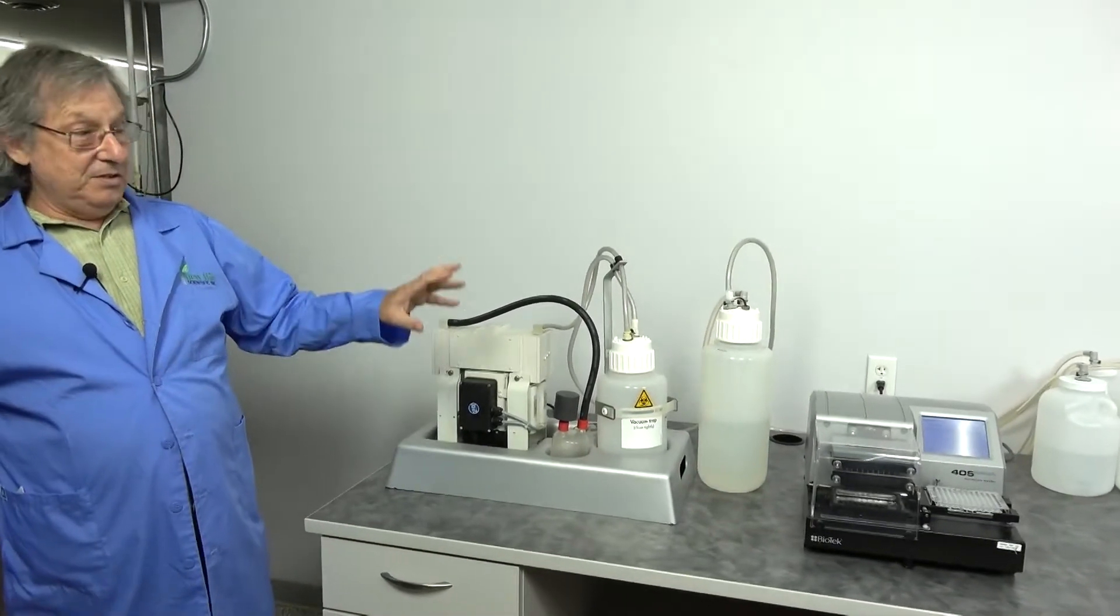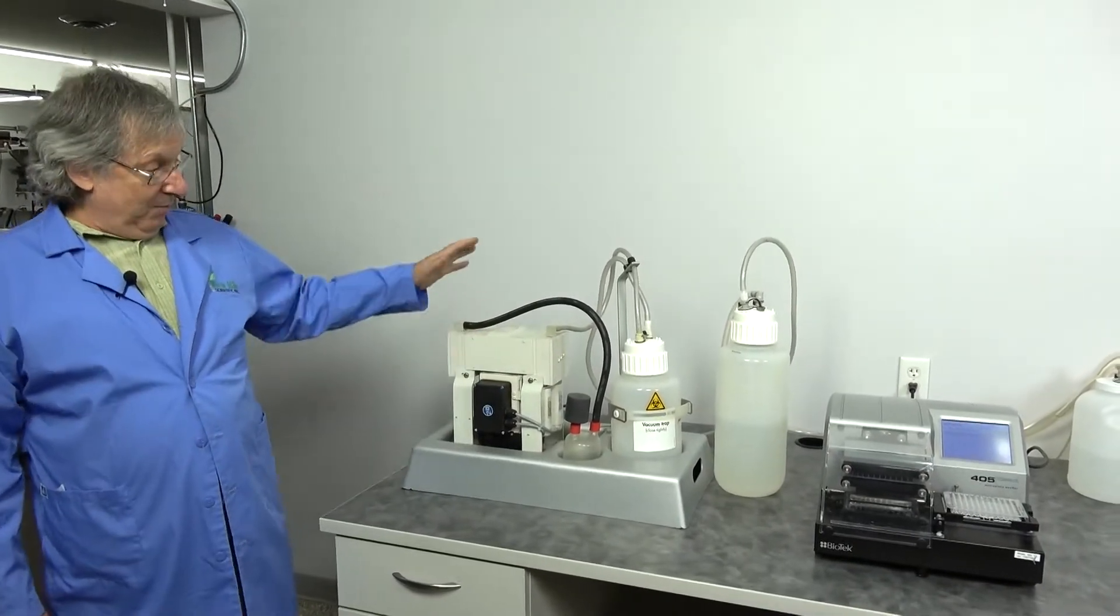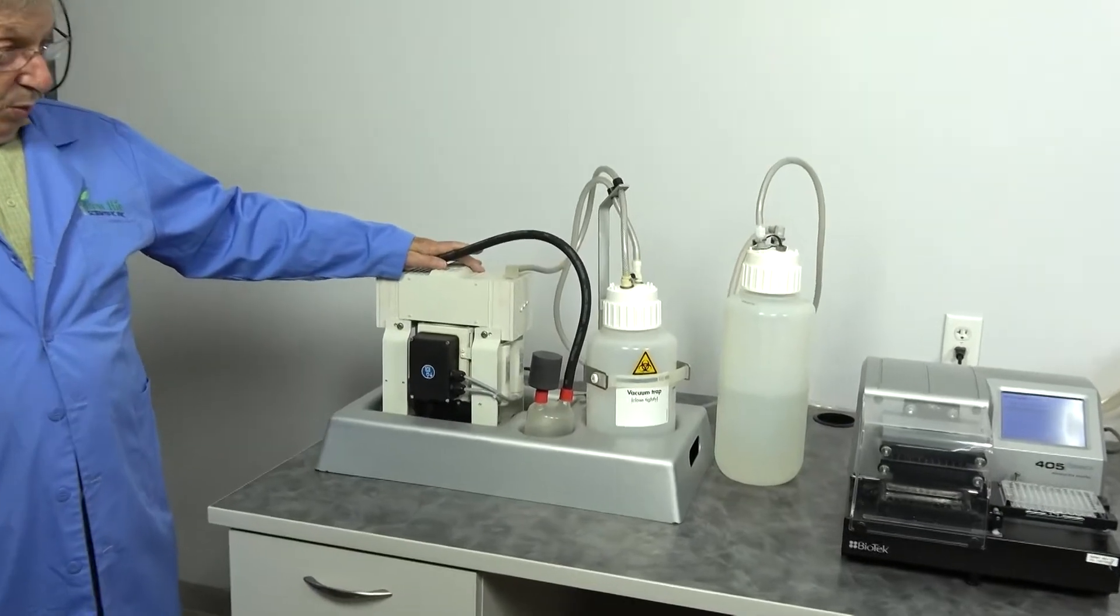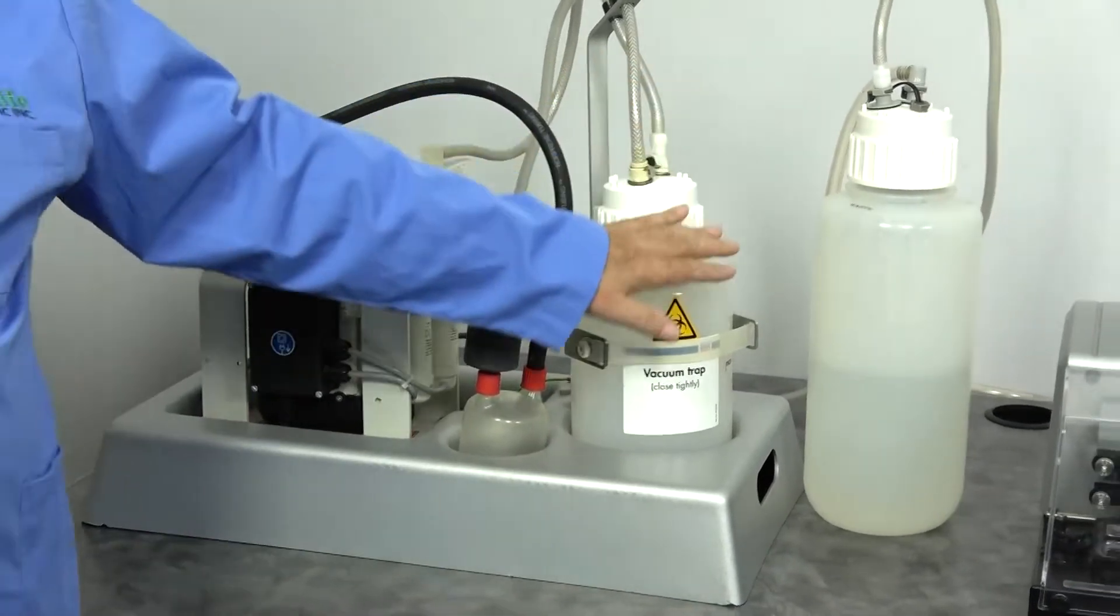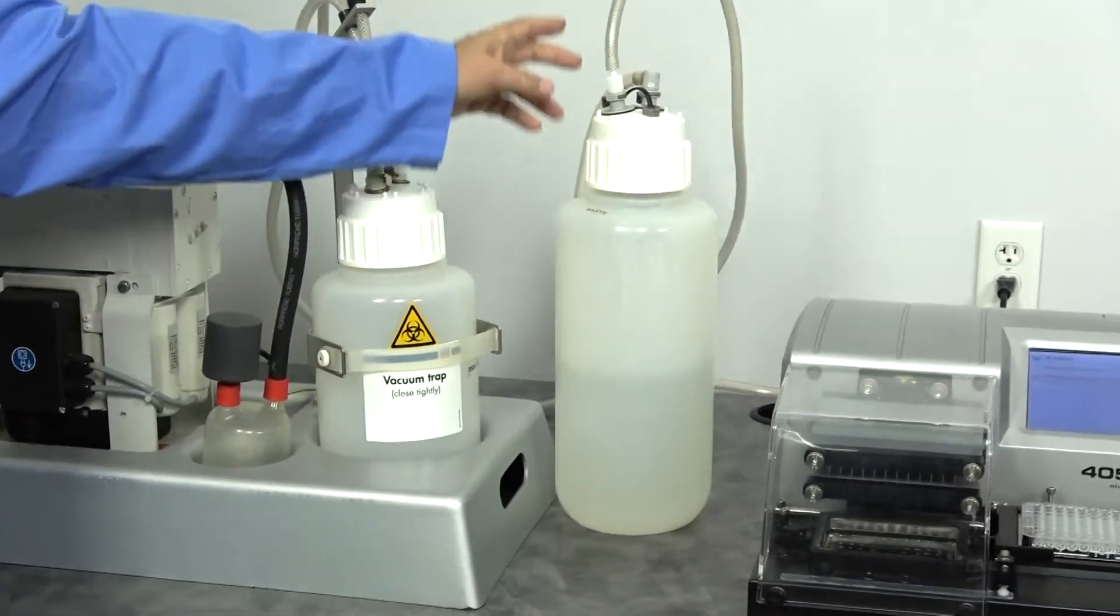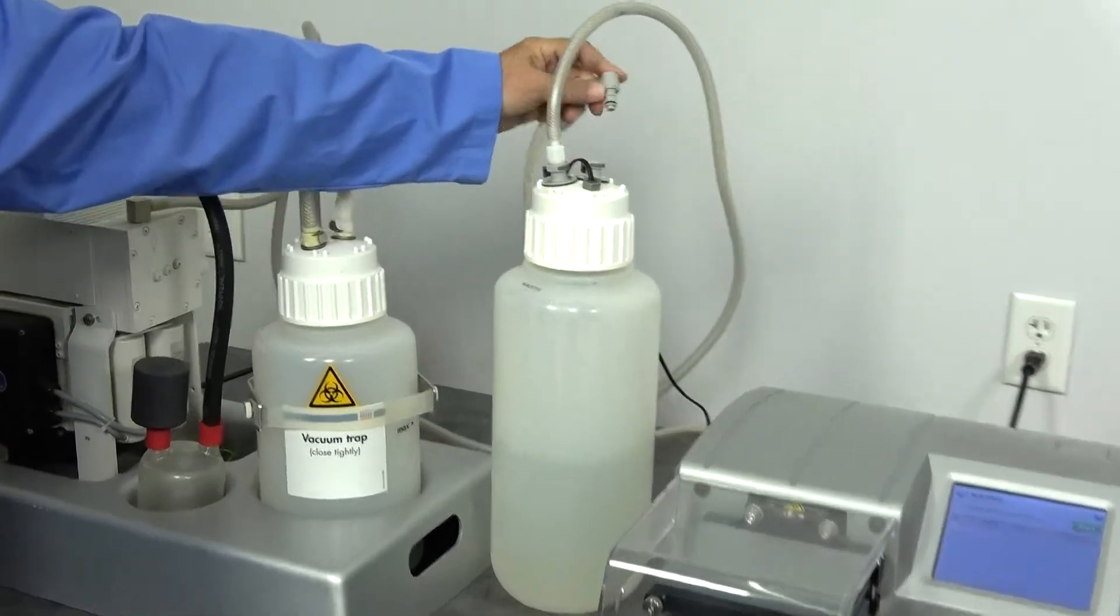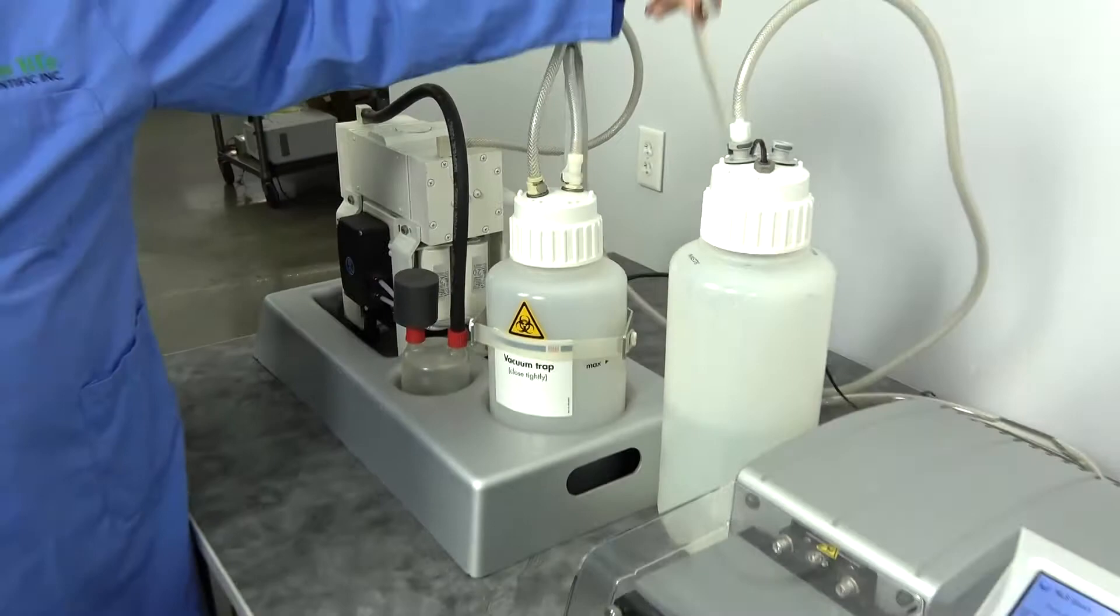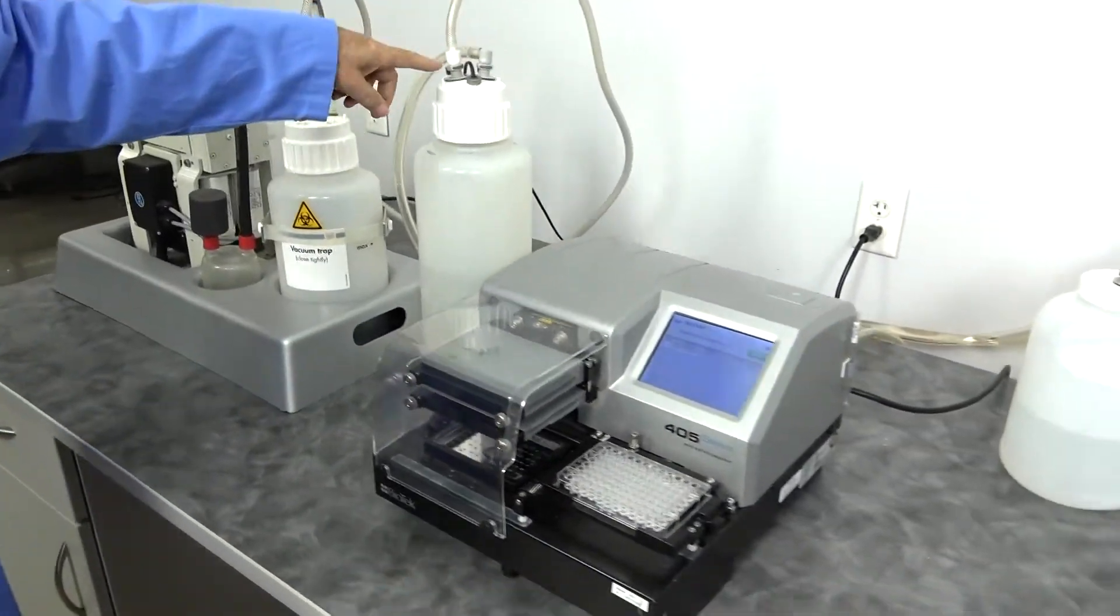This unit is sold by Biotech as a turnkey system, and we've reconfigured it that way here as well. The unit comes with a pump, your vacuum trap, waste bottle with sensor, and quick-release valves with automatic shutoff so that no water or liquids will spill out of your tubes.